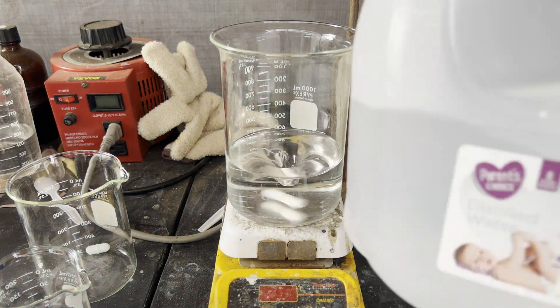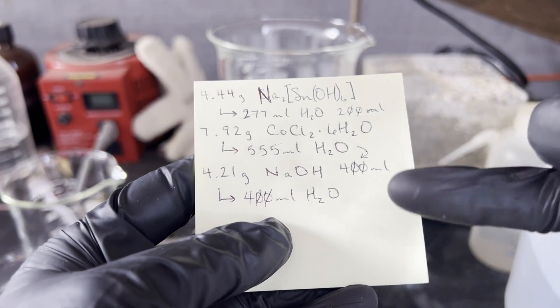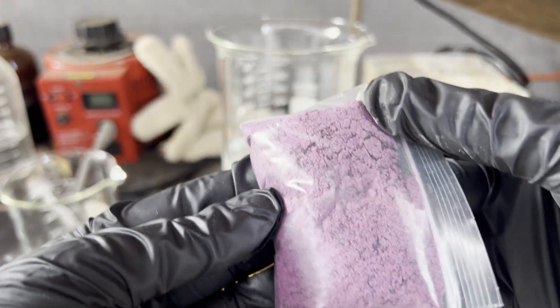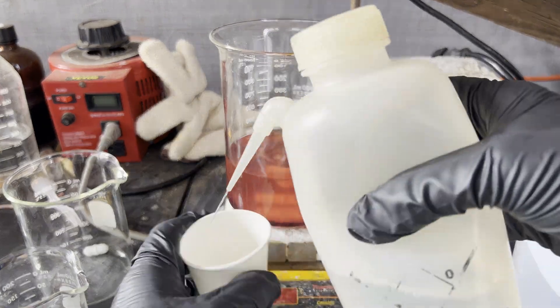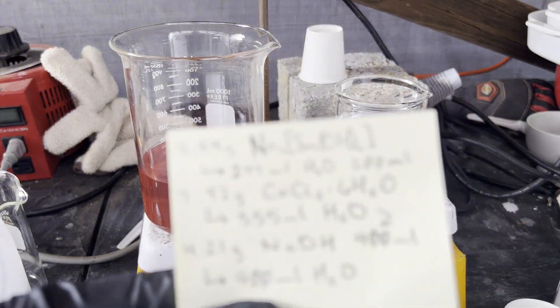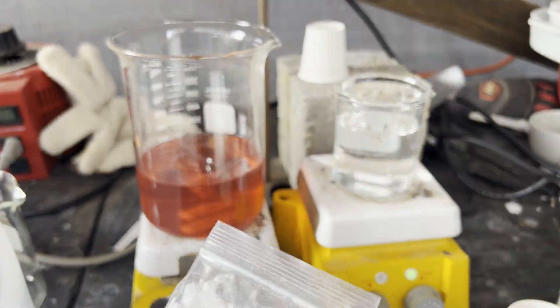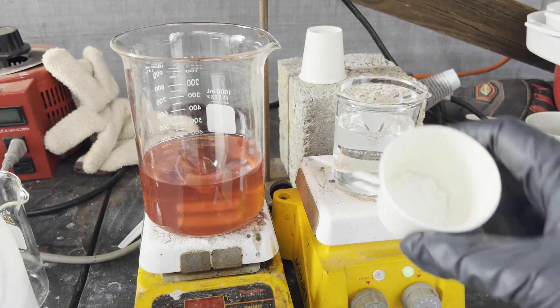First, I dissolve cobalt chloride in distilled water. Then I dissolve sodium stannate in distilled water. In the bag is what I made, and it looks similar enough to the reagent grade stuff in the vial, so I'm confident in its purity.